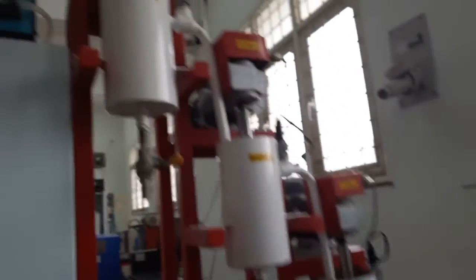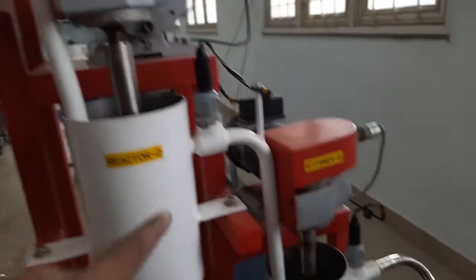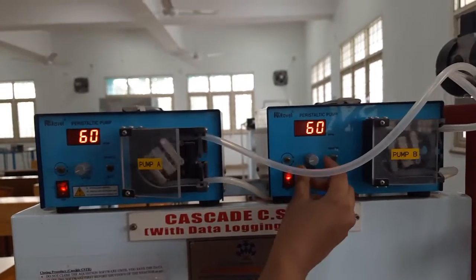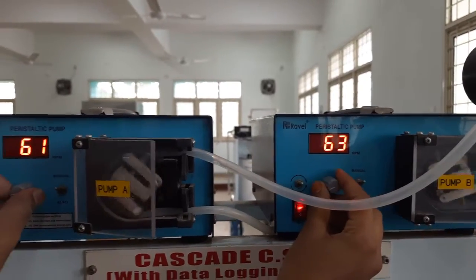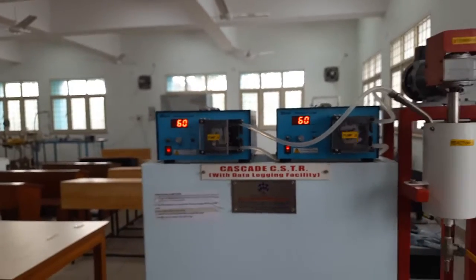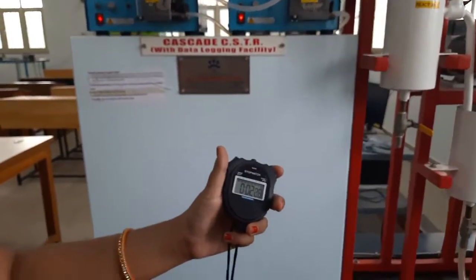Remember, last time we did only one CSTR. We have to ensure that this is rotating. Yes, all CSTR stirrers are working. So once we have done that, we already switched on the main switch. Now we can switch on the peristaltic pump and keep 60 rpm in both. Even if in the beginning it is at a different rpm, we have to ensure that the first reading is done at the same rpm. So in both peristaltic pumps we are keeping 60 rpm and we start the stopwatch.